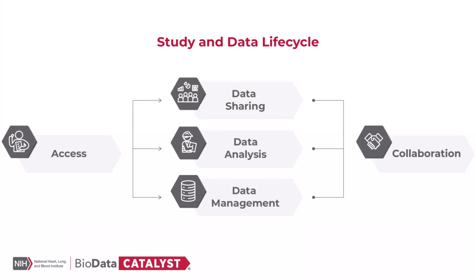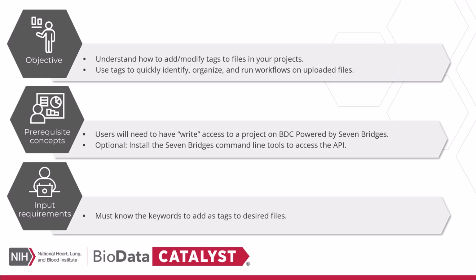Videos in this series span topics across the study and data lifecycles. This video will discuss how to apply, manage, and use file tags to find, organize, and subset data files on BDC Seven Bridges. After watching this tutorial, you'll understand how to add or modify tags for files within your BDC projects and use the tags to identify, organize, and run workflows on files.